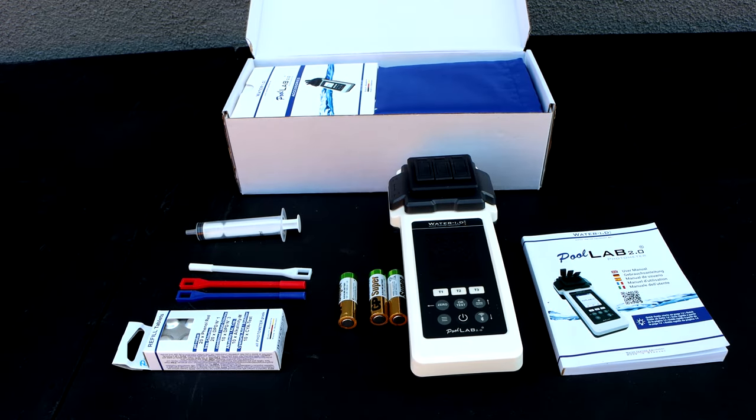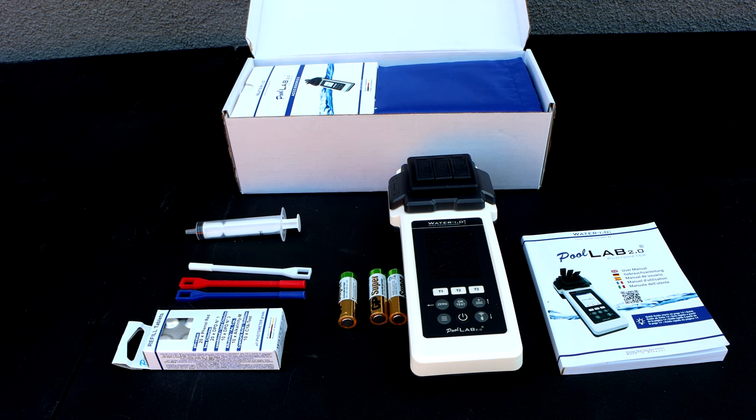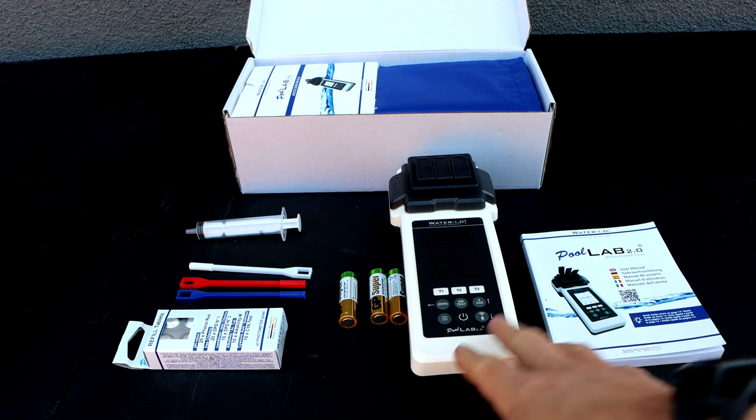In this video I'm going to show you the Pool Lab 2.0 photometer. In the US market you're going to be able to buy this under the name Water Tester.